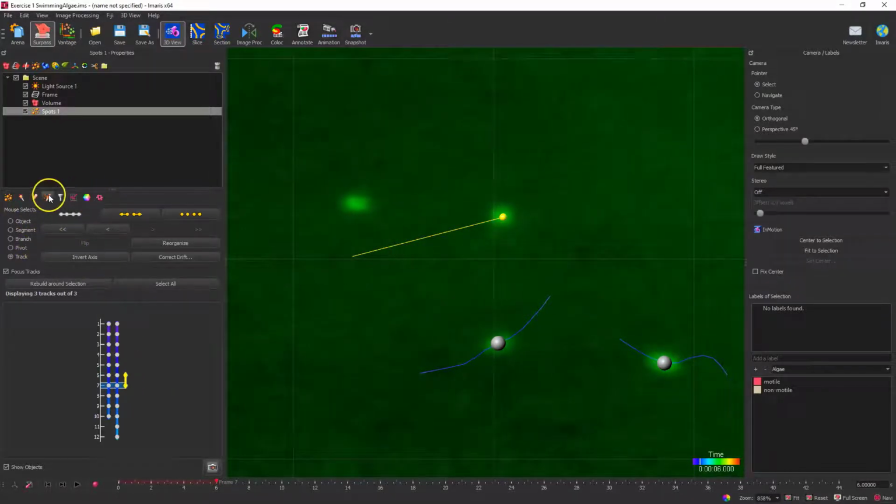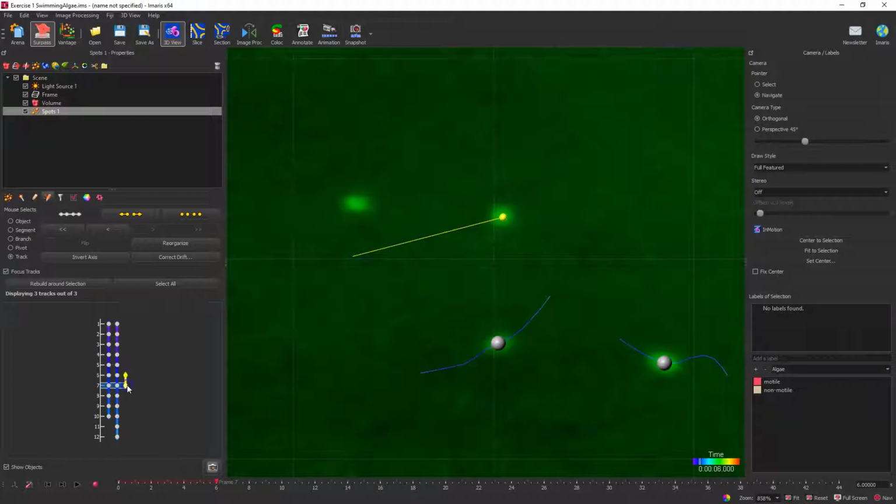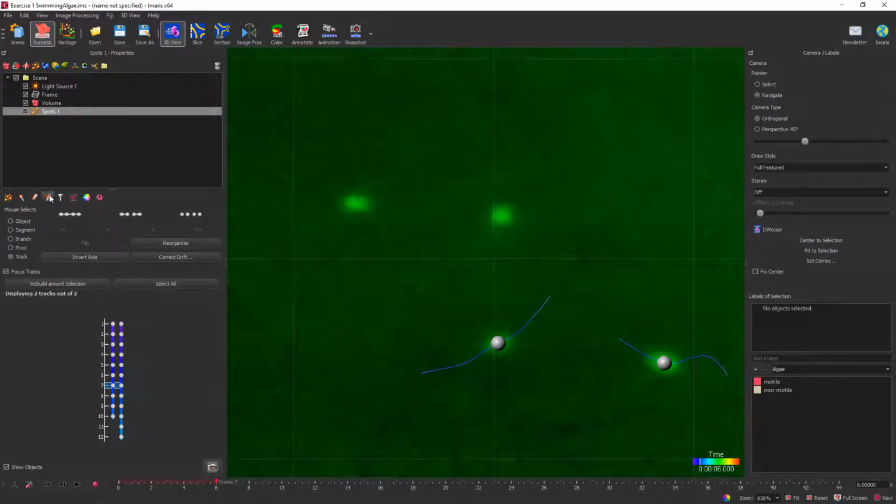Right now, on the track edit tab, that's the little, looks like a marker with some little dots behind it. I think it's supposed to be a connect the dots icon. I've got a couple different options for what our mouse can select over here. Now by default, the option is mouse selects track. So you can see that when I click on any one of these objects, the whole track of objects is selected. That's pretty easy. If I want to delete this track, I can select either of these. Then I can go to the edit tab and click delete. And now it's gone.